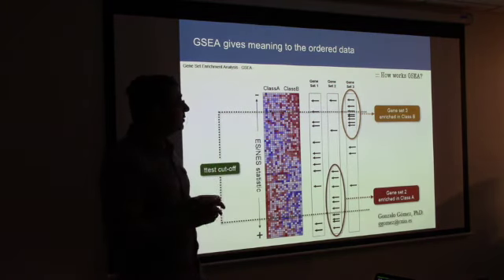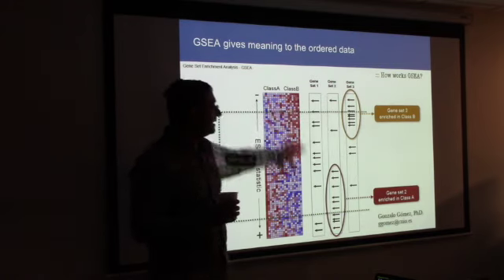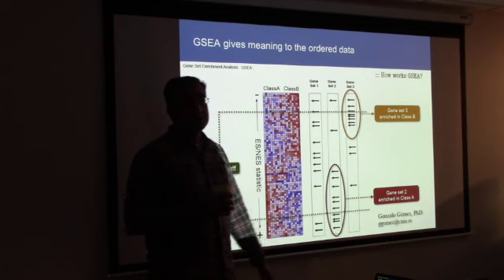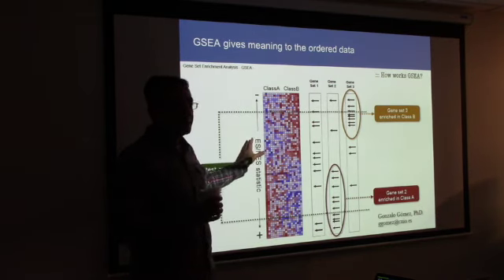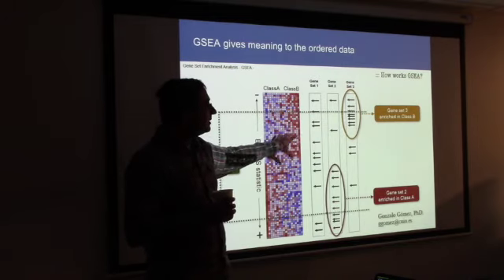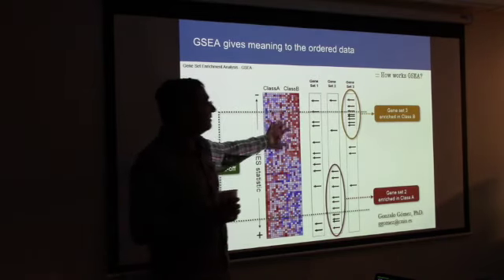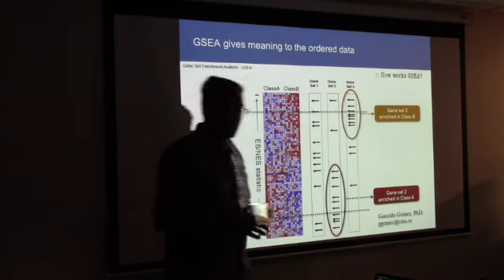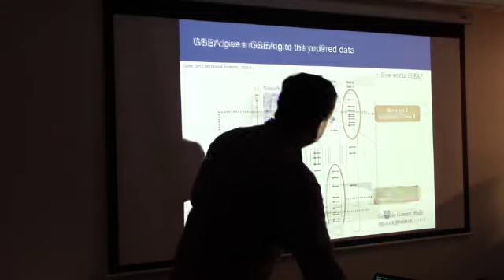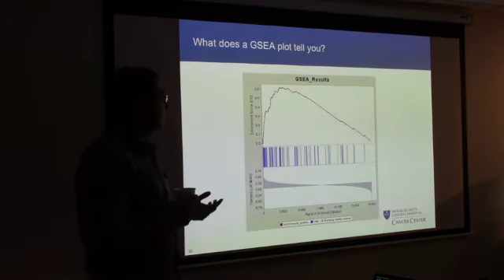And then in the end, you want to score, that way you can compare gene set 2 to gene set 3 or gene set 1 to gene set 3. So gene set 1 tends to look like this is what a random gene set would look like, which has no enrichment in your hypothesis. Whereas gene set 3 and gene set 2 tend to be enriched in either direction, like one is enriched in class B, the other one is enriched in class A. Okay? That's what you're trying to look for. Okay, so these are the results that you get in GSEA.